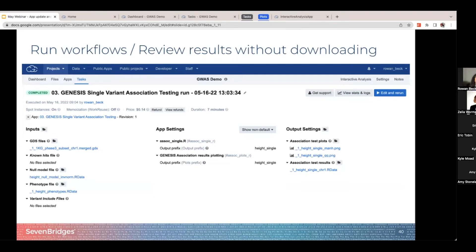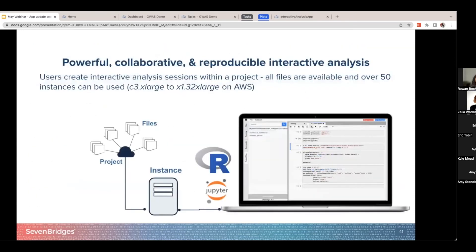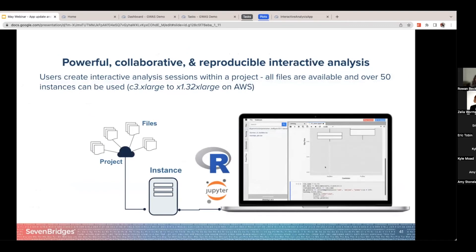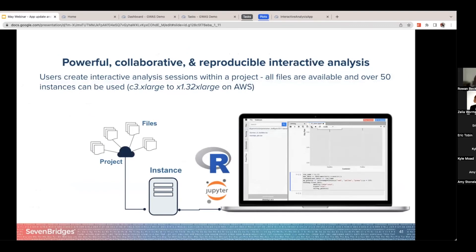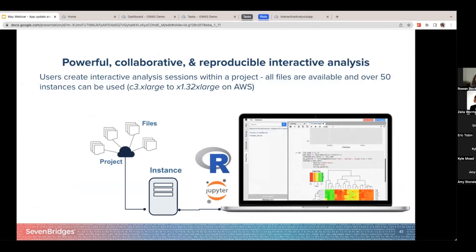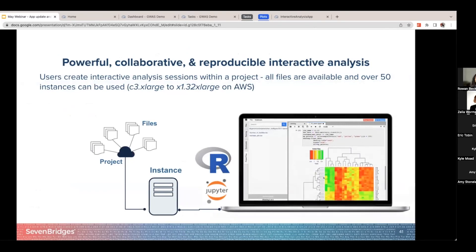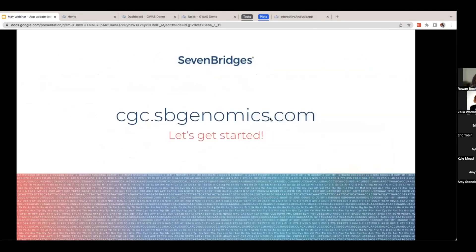If you click the interactive analysis button at the very top, that will create an instance — an interactive instance of either RStudio or Jupyter Lab notebooks, whatever you prefer. You'll have access to any of the files or anything generated in the project. With that, we can head to the website and get started.